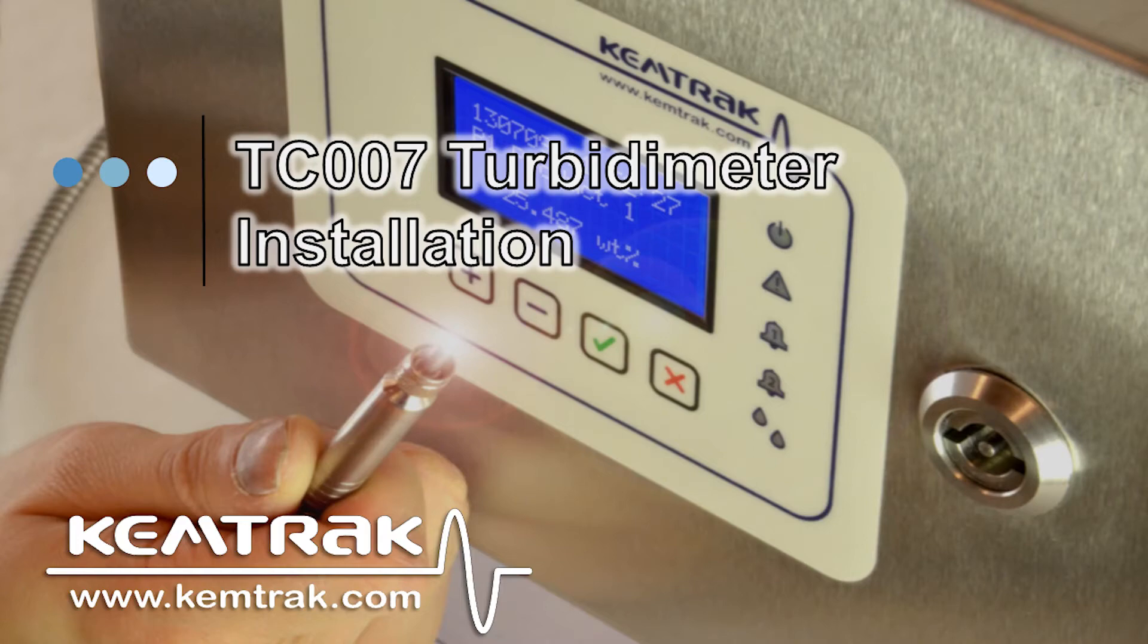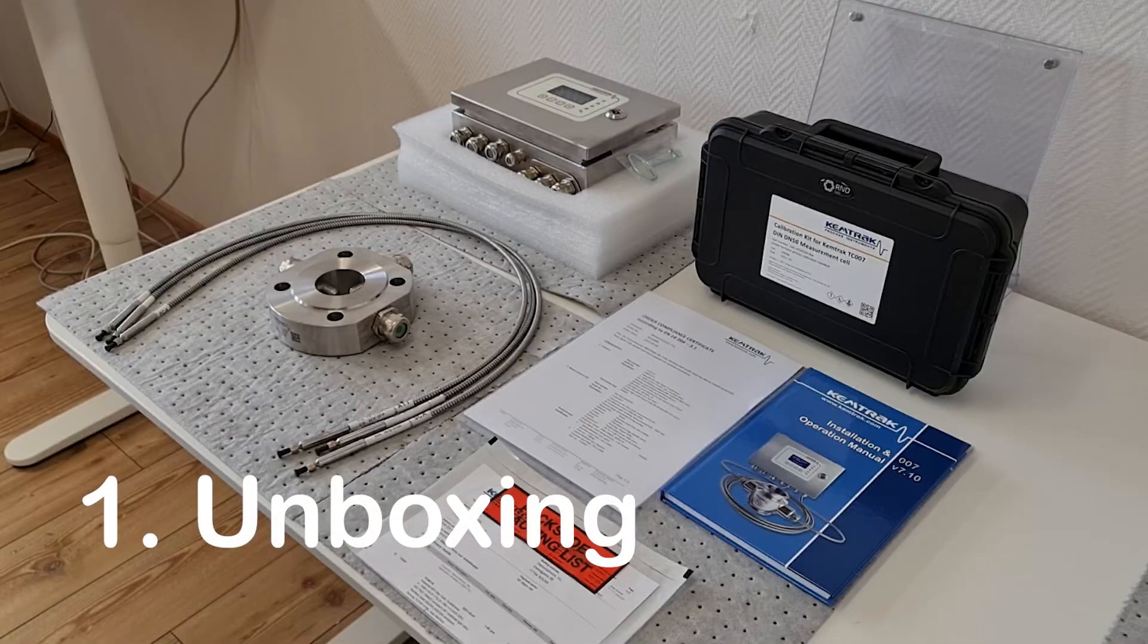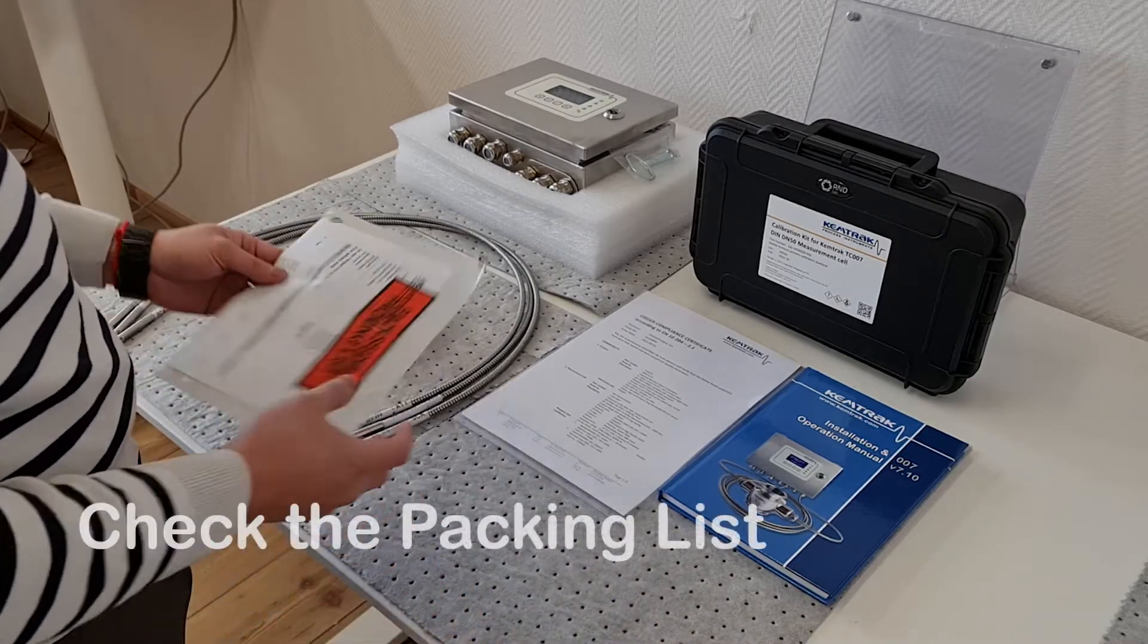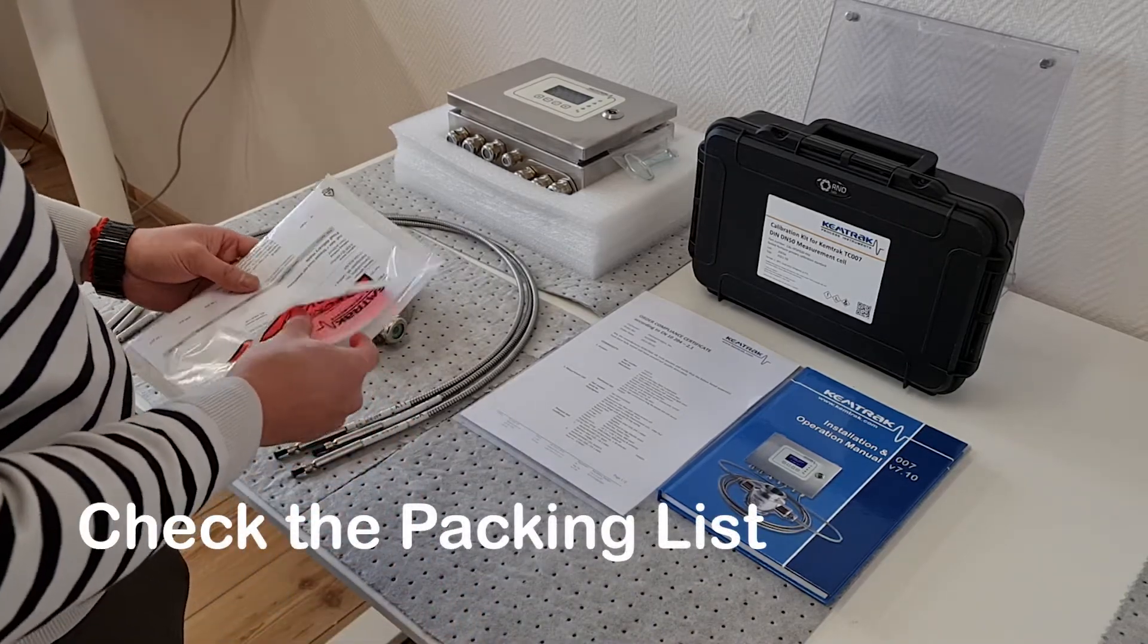This video will show you how to install a Kemtrak TC007 turbidity meter. Before installation, it is important to confirm the contents of the system delivered and that it matches what has been ordered and meets the necessary process specifications.